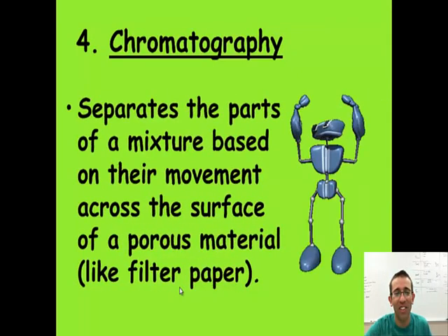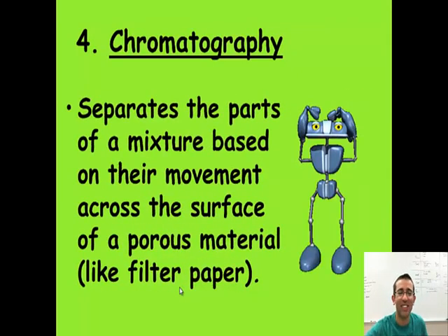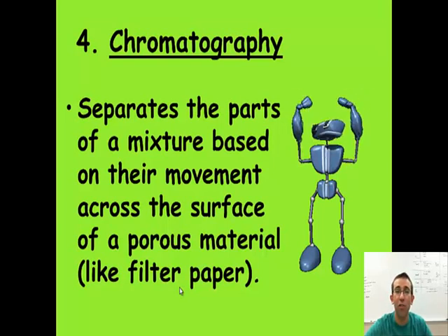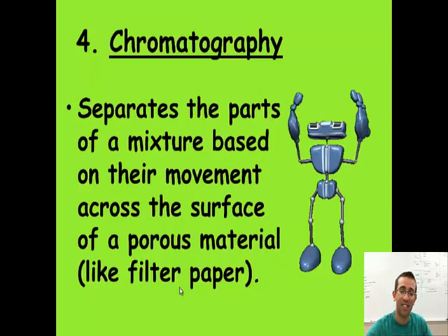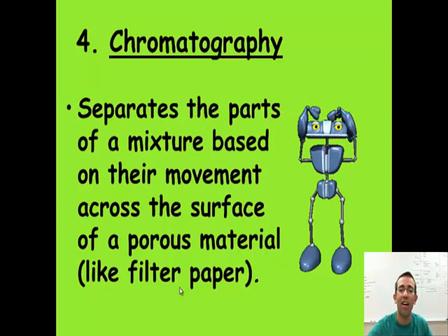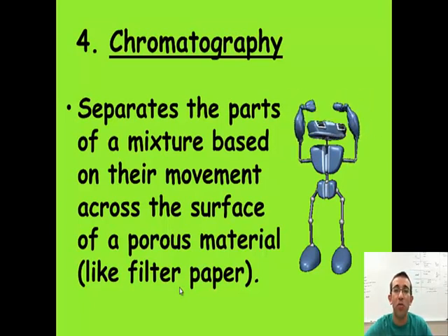Oh, chromatography. Chromatography is one of my favorites. Chromatography is separating a solution across a porous surface. Sometimes you can use filter paper for this. They also have chromatography paper. This is great for separating inks, like in a pen or a marker, and we'll actually do that in class. We'll do some chromatography. It's kind of cool to see. This is separating it based on its movement across the surface.